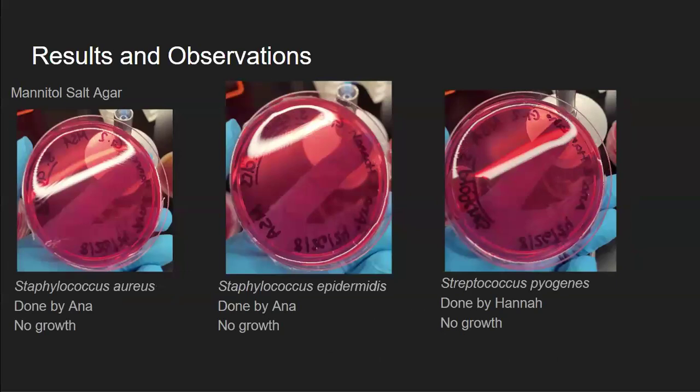Mannitol salt agar. For Staphylococcus aureus, there was no growth. Staphylococcus epidermidis and Streptococcus pyogenes also had no growth each.